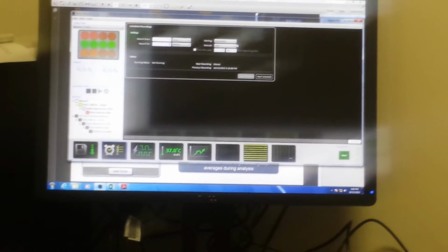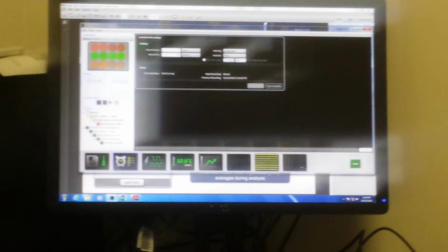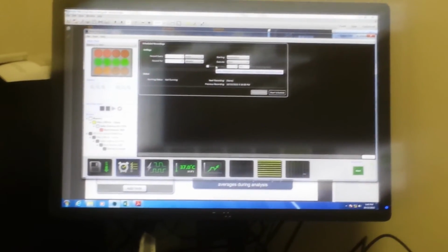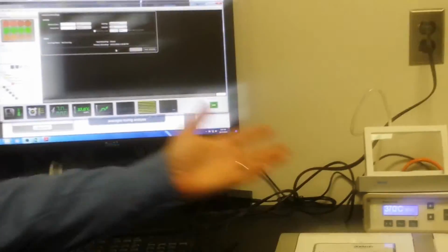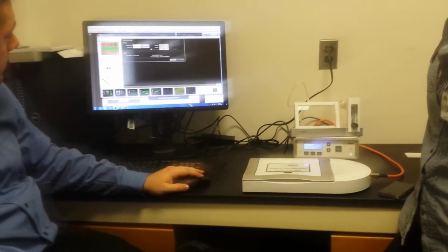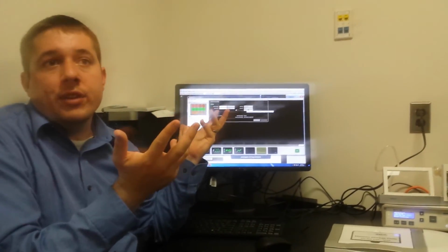And triggered stimulation. What's in it? Right now this is just the storage plate. Whenever it's not in use, keep the storage plate on it. But there's an auto-stimulate where you can tell it to record for X number of minutes and then stimulate at a given time.